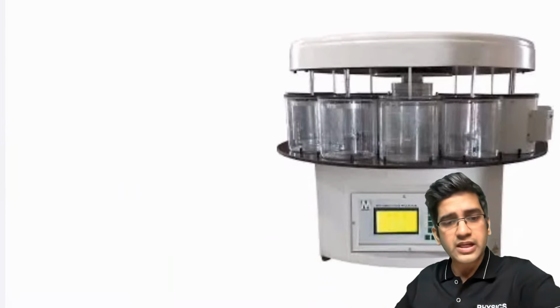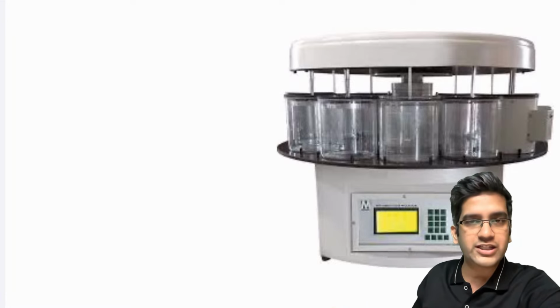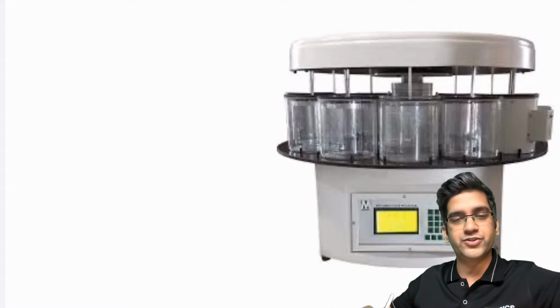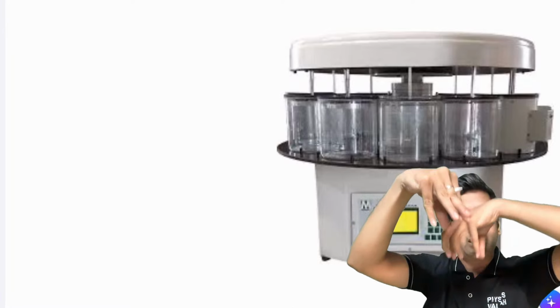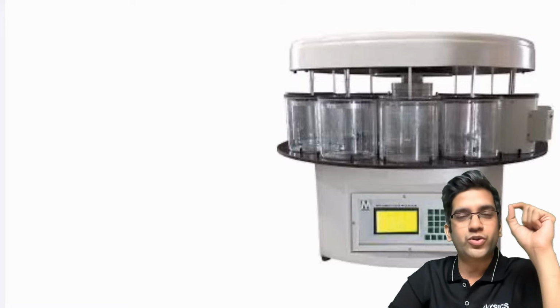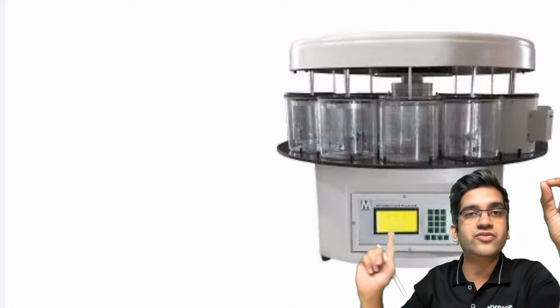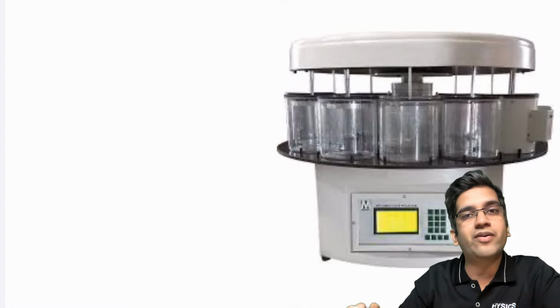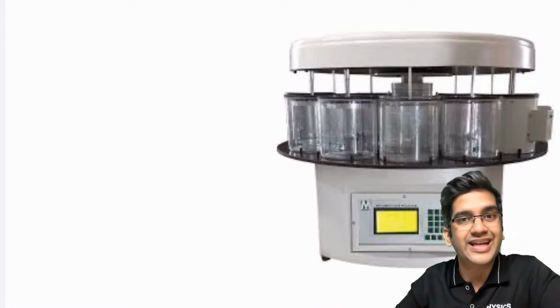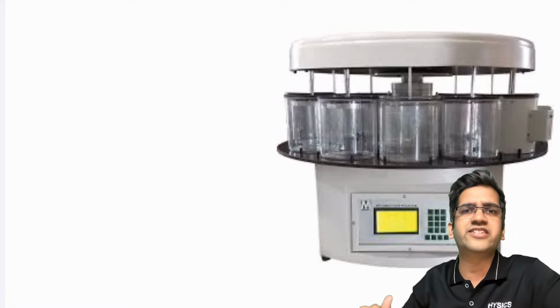Now, we have something called an automated tissue processor. If you get a chance to go into the histopathology division of your college lab, go and see, there'll be jars like this. It's an automated tissue processor, right? It keeps on moving up and down, up and down. Just go and see it once. Because there are lots of jars here, lots of solvents, lots of containers. It might have 50, 60, 70, 80, 90, 100% alcohol in serial concentrations. It'll have a component called xylene. It'll have a component called formalin. Formalin is a fixative by default, right?